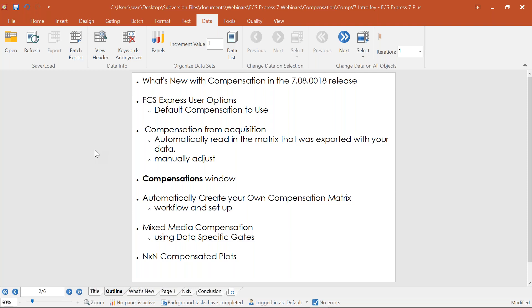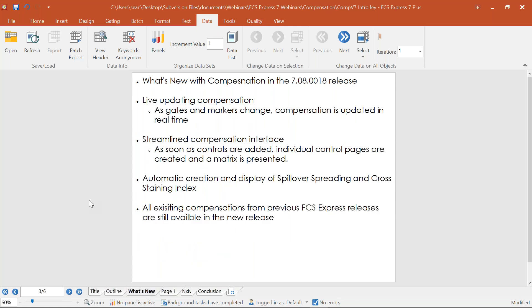We're going to show you how to utilize compensation from the time of acquisition, essentially automatically reading in the matrix defined on your instruments. We'll show how to manually adjust compensation — though we don't necessarily recommend this, as manually adjusting compensation by eye is a no-no these days. We'll also dive into the compensations window and how to automatically create your own compensation matrix using single stain controls, mixed media compensation, and data specific gates.